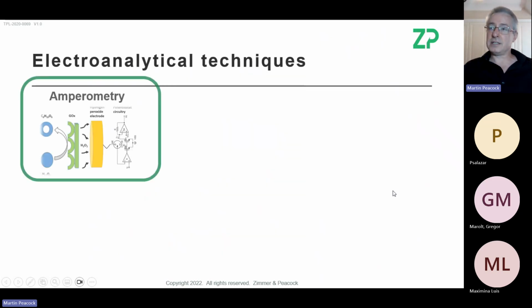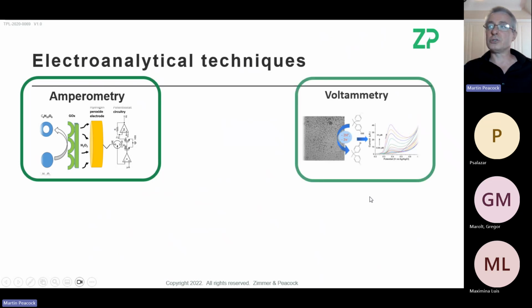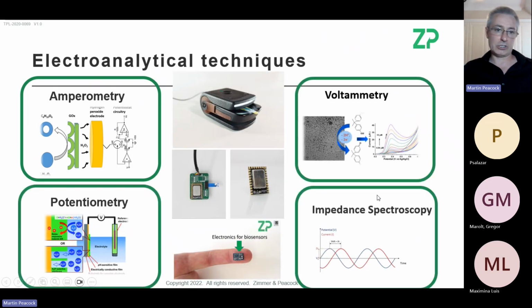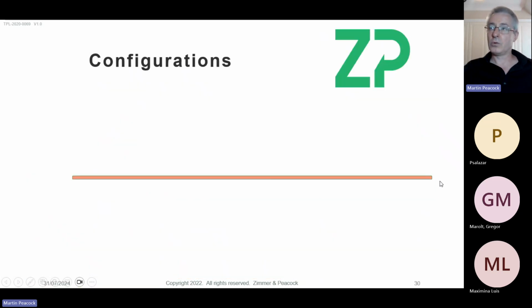With that said, we live in a great moment, because the idea that you can do most electrochemical techniques on a potentiostat these days that's the size of this finger is a really incredible moment. And in fact, we sell these. There's a little chip here, which is very shielded from electromagnetic noise. That's something we do sell on our website.